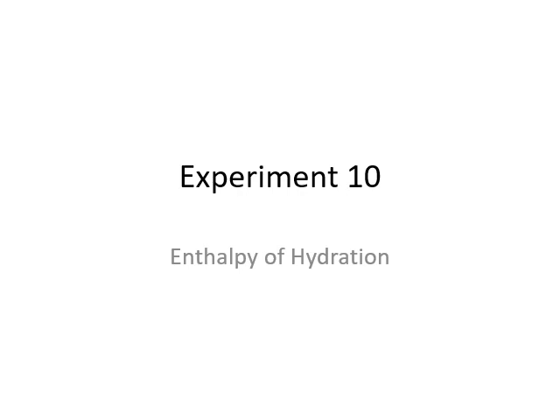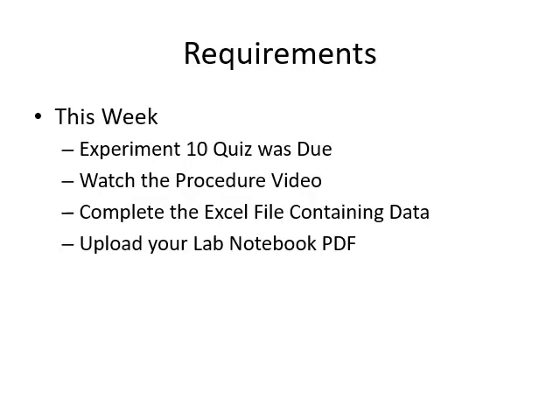Experiment 10 deals with the enthalpy of hydration. And enthalpy is just a way of measuring the amount of heat a reaction gives off or absorbs without worrying about the amount of work that is done by the chemical reaction.